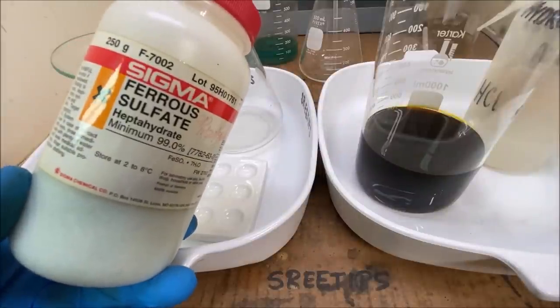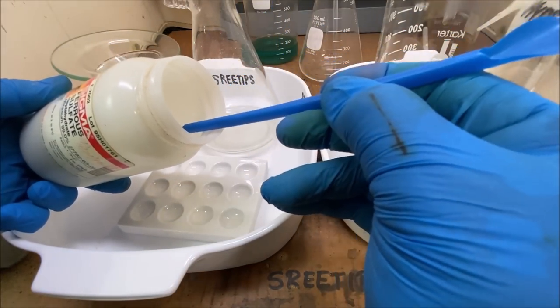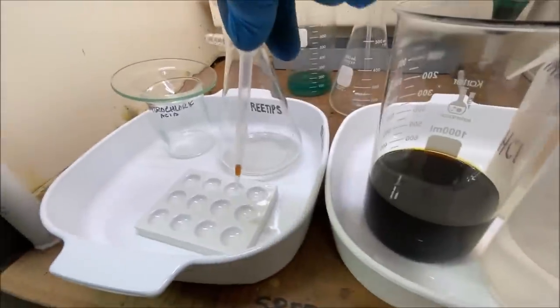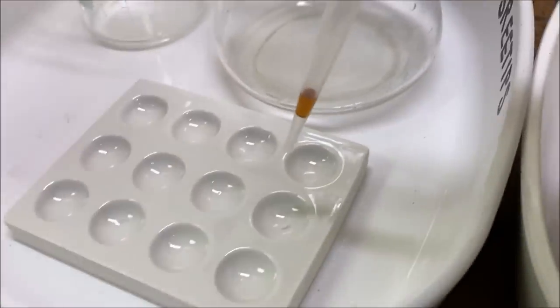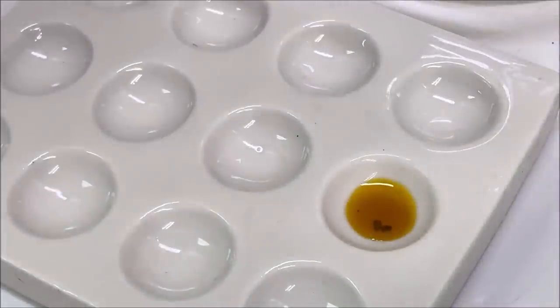I've got some ferrous sulfate here. And what we'll do is get a few granules of this into this spot plate. Couple of little crystals of it. Get a little bit of our solution here and add it to this spot plate that's got the ferrous sulfate in it. If there's gold in here, we'll see a brown cloud forming. And I do see a brown cloud forming, which means we've got gold in solution.